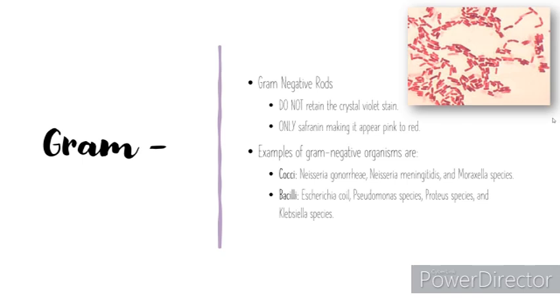I'm going to take my word back on that because Enterobacteriaceae is gram-negative. I apologize. Gram-negative rods, they're not usually gram-negative cocci, so you should expect gram-negative cocci to be an over decolorization usually, but there are always exceptions to biology, and there are real gram-negative cocci, but they're usually not as common.